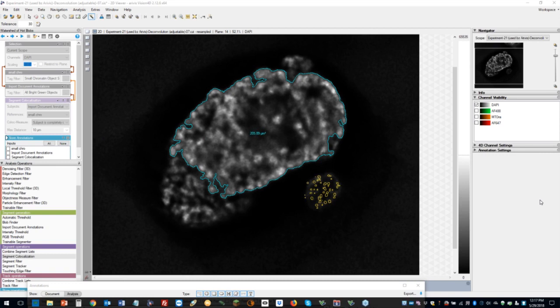And a question here from Laura, and she asks, can you also handle time-lapse images to do something like tracking over time in 3D? And can you also measure intensities or other features along a track over time? Yeah, absolutely. So that's a great question.